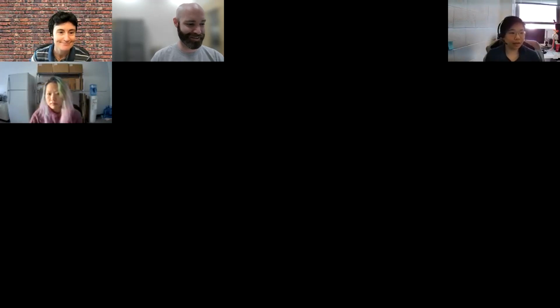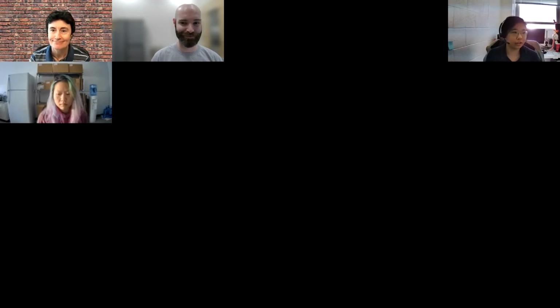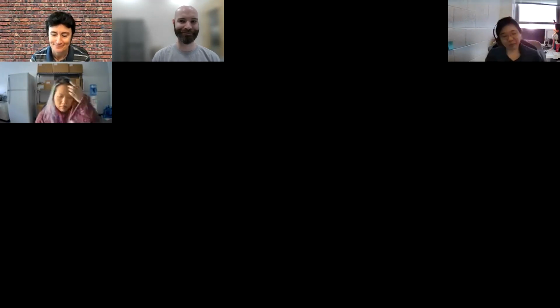Yeah, I just have a quick introduction and then I'll pass it on to Michelle. First, I want to thank everyone on the pangoLEARN team and the UShER team so much for developing this tool. It's allowed us to quickly group sequences together and enable our epi partners to do surveillance with the virus in our city.